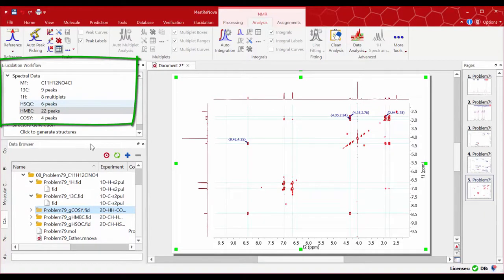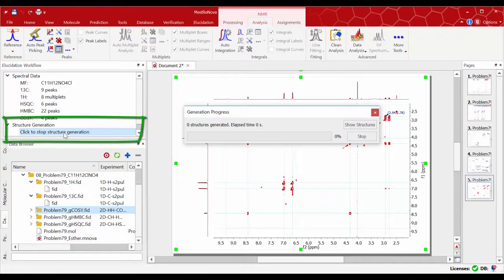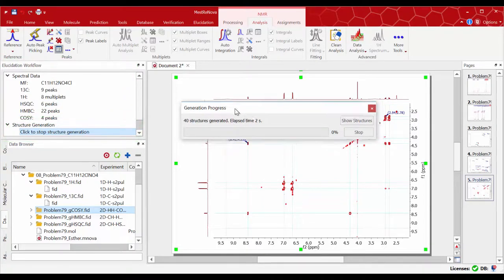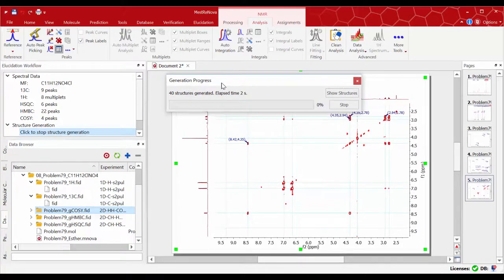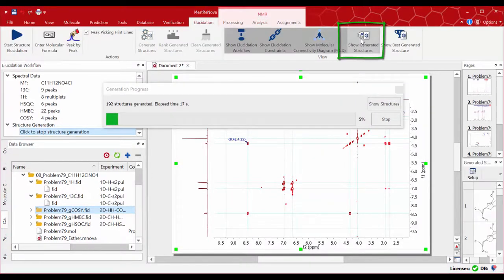Now we are ready to start generating candidate structures by clicking on 'Generate Structures.' Click 'Show Structures' on the generation progress dialog box, or access it via the elucidation menu.